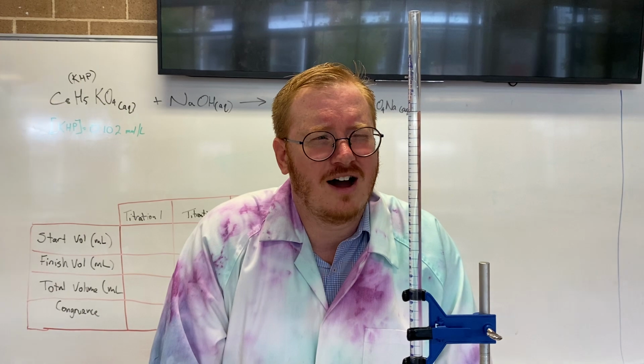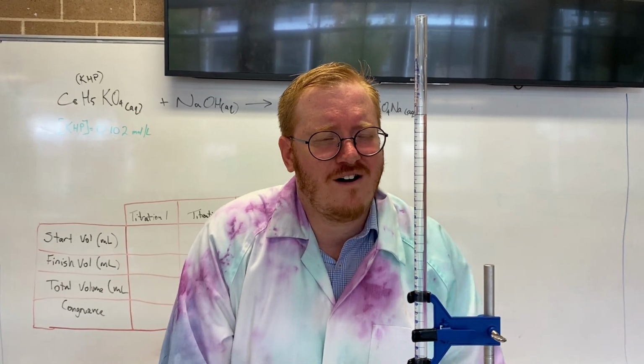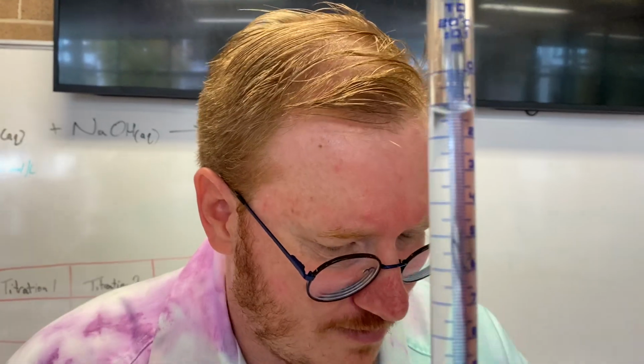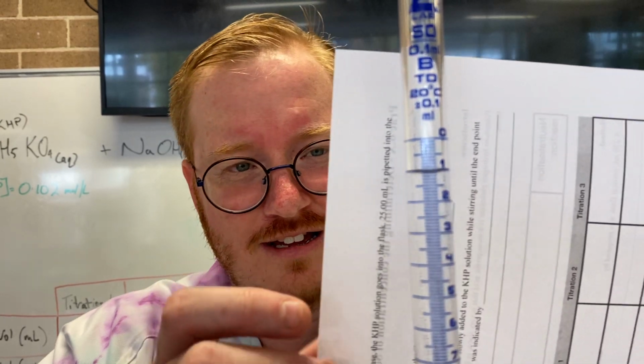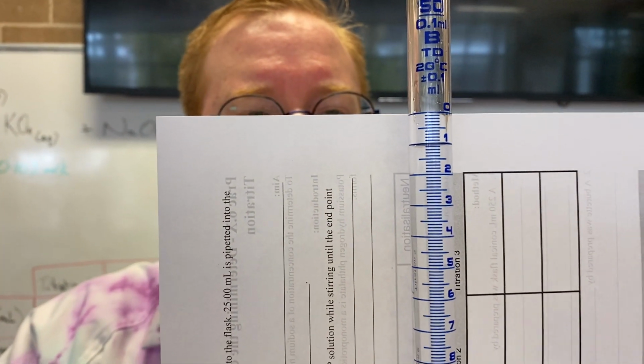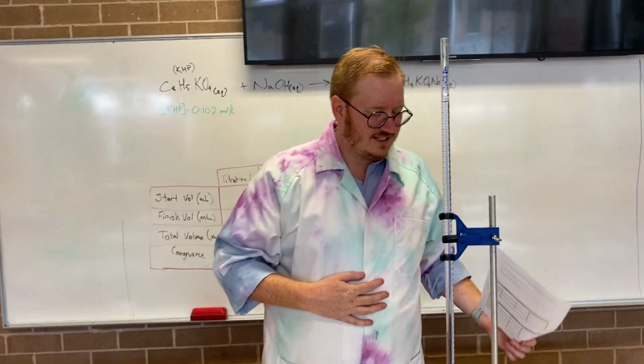All right, I've got my reading there as 1.15 mil. Let's see how the camera does. I might put a white sheet behind it. It's a bit wobbly too. I don't know if me stabilizing it is going to help. Yeah, no, that's good. Cool, thanks Mr. Galliner.